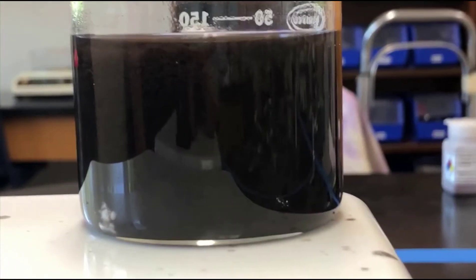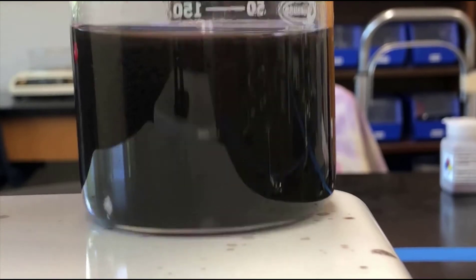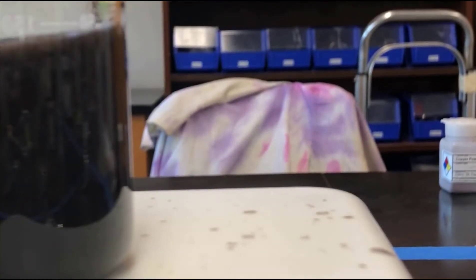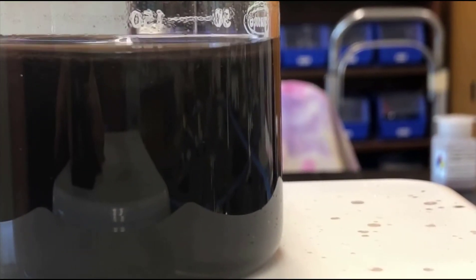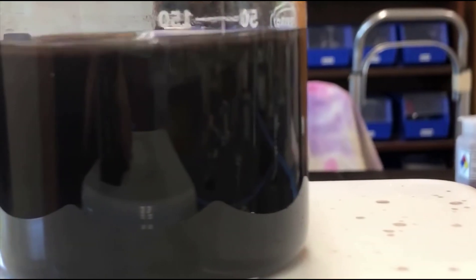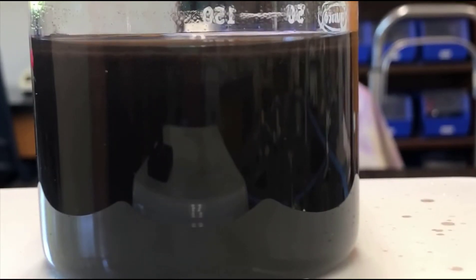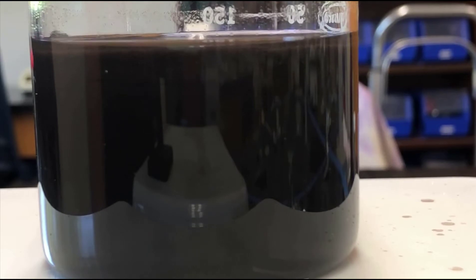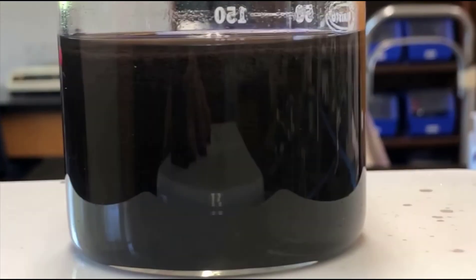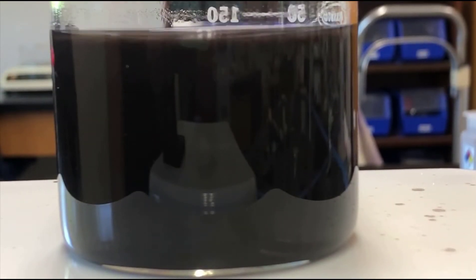We'll run a time lapse, and you can see the precipitate is starting to settle. You can see it's also boiling in there, so I'm going to move that over and run the stir — that'll keep it from bumping. I'll run this on a time lapse and let it settle once I get control of the temperature; basically I'm just trying to control the temperature at this point.